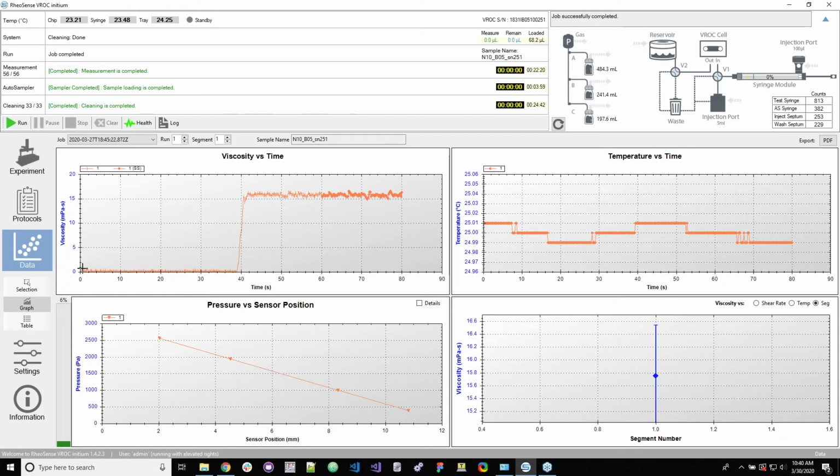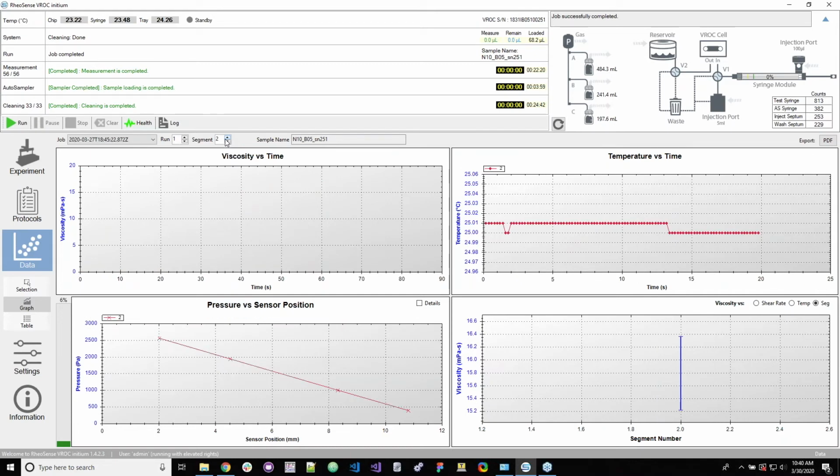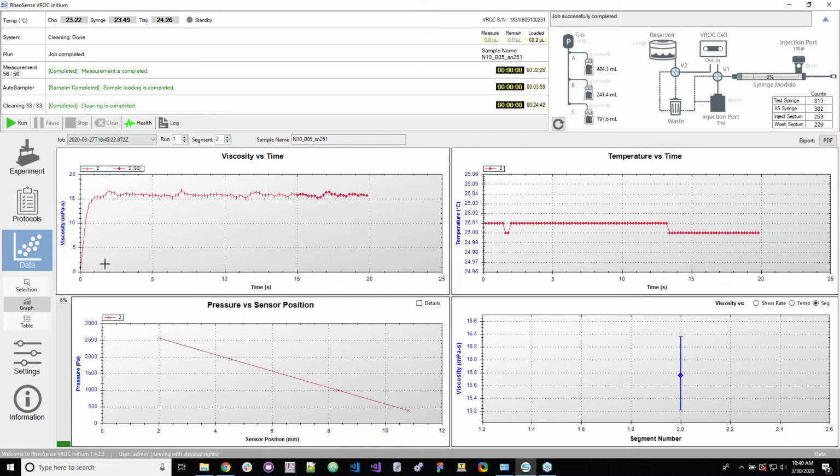So your wait time is how long the instrument waits before collecting data points, measuring the data points and saving those data points. And so we're waiting for the flow and pressure to reach steady state before taking measurements. This might be more clear in the non-priming segment. So we'll move on to segment 2, which is the first segment that we used and started collecting data.